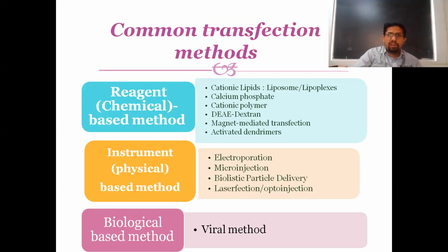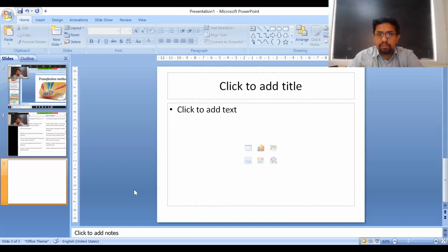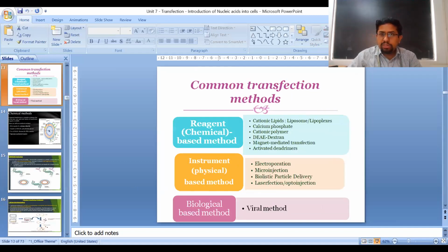Now we can broadly classify the transfection methods into 3 categories. So what are these methods?